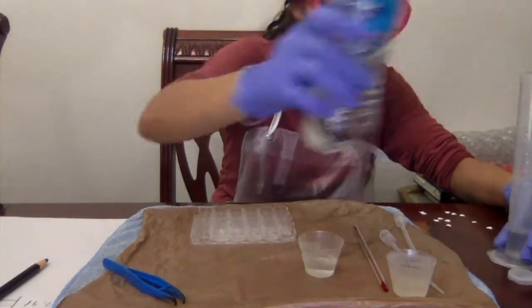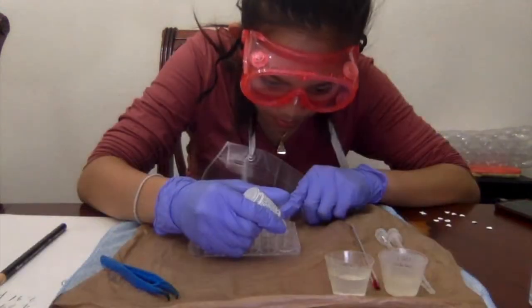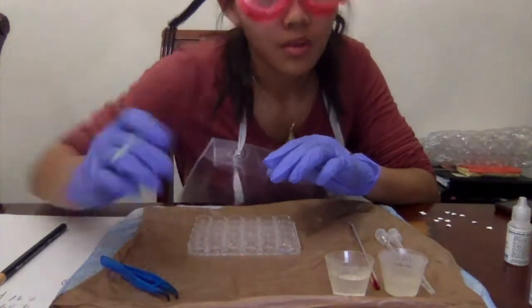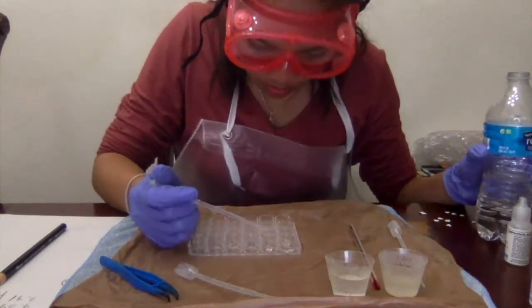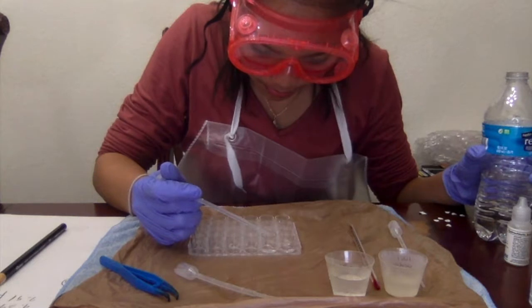At first, 1.3 and 2.3 pH had very slow times. Each had an average time of 2.06 minutes and 1.17 minutes respectively. As the pH increased from there, the float time for the disk decreased. 3.3 pH had an average time of 20.54 seconds, 4.3 pH had an average time of 17.91 seconds, and 5.3 pH had an average time of 18.28 seconds.